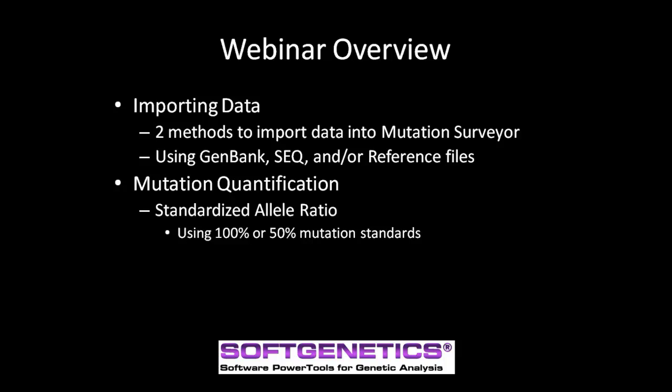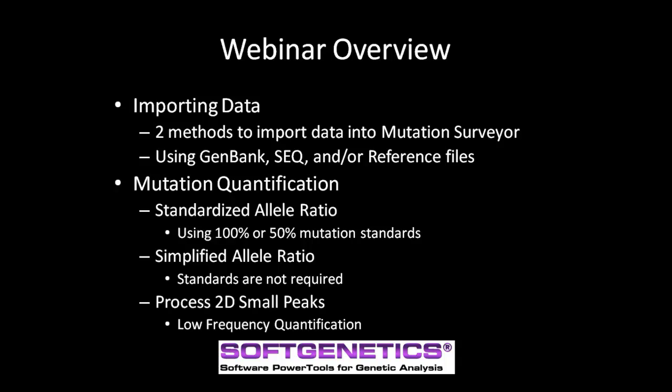There are two different options of quantification that you can select from. The first is by using a reference to quantify the mutation, also known as standardized allele ratio. The second method does not require a reference and is calculated directly from the sample. Mutation Surveyor uses GenBank, SEQ, and reference files to distinguish normal allele from a variation and compares the peak intensity for both. The last topic we will touch upon is the Quantification of Low Frequency Variants using the Process 2D Small Peaks option in the Quantification dialog box.